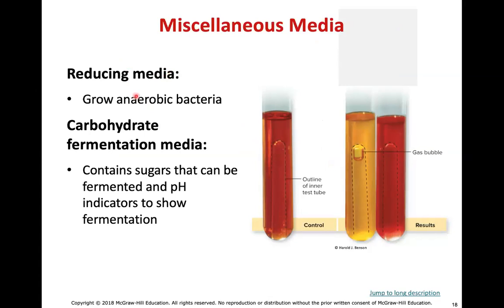Reducing media, this would be a media that will allow for anaerobic bacterial growth. Anaerobic means without oxygen. And then we also have carbohydrate fermentation media. This is testing for fermentation.